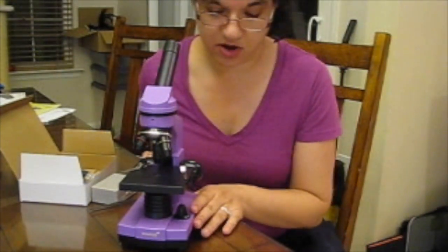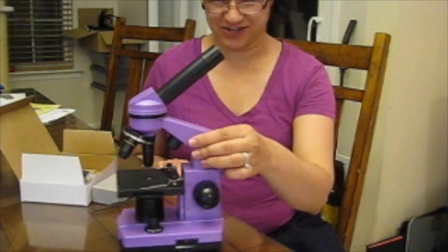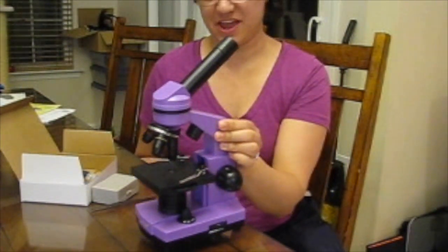So this here is the Levenhuk microscope. I got it in the purple color, which I think is really fun for kids.